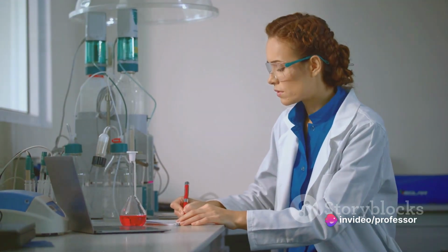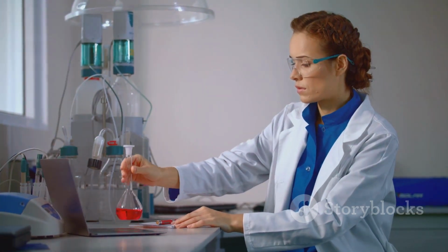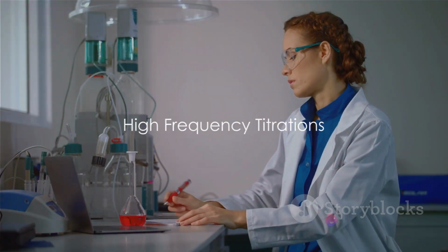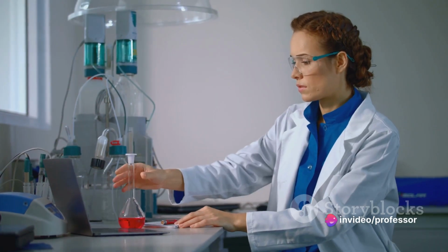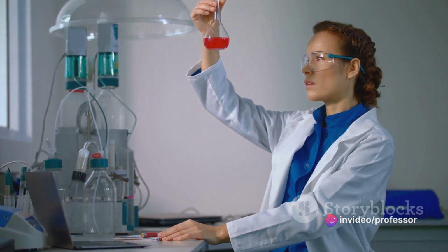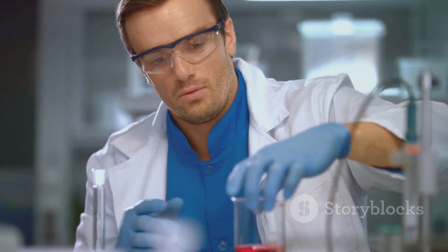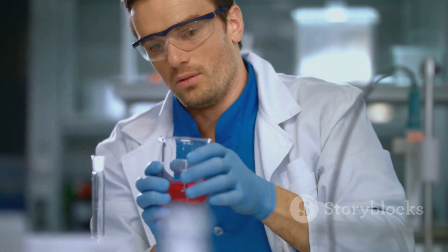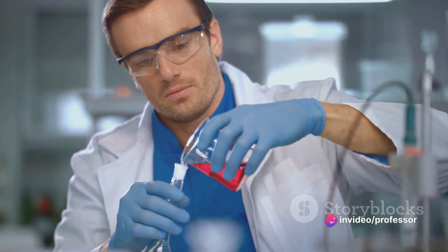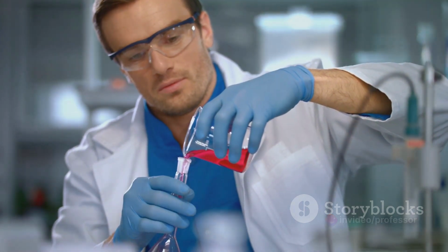Conductometric titrations, a practical application of conductometry, bring us to our last topic, high-frequency titrations. High-frequency titrations might sound complex, but they are simply another fascinating aspect of conductometry. These titrations are a unique method of conducting experiments where the frequency used is much higher than what we usually encounter. The beauty of high-frequency titrations lies in the fact that they allow us to study the reactions that occur at a rapid pace, reactions that would otherwise seem instantaneous to the naked eye.